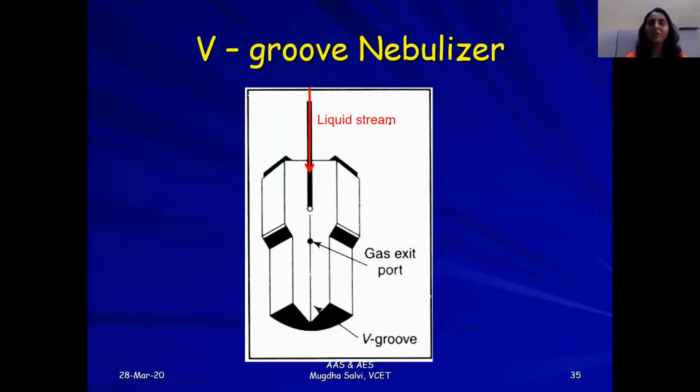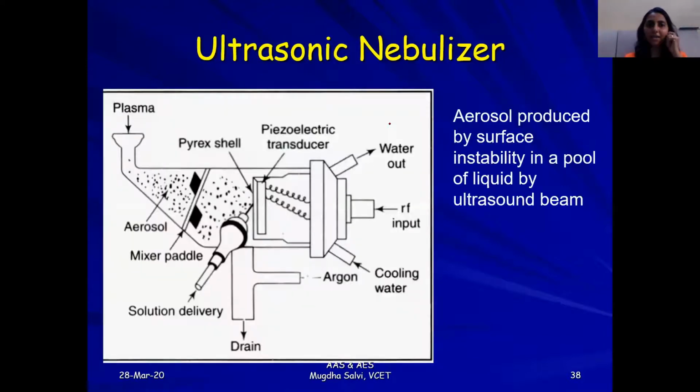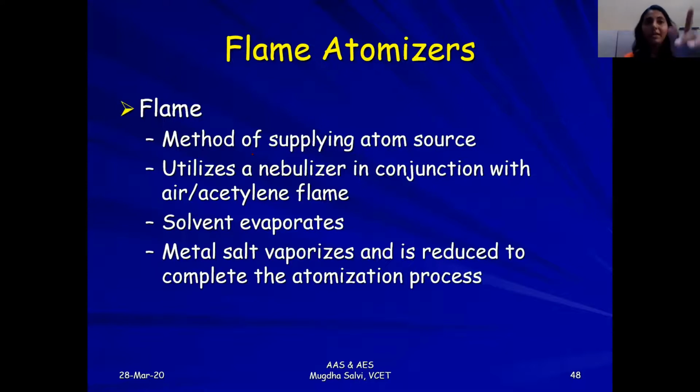Then we have the V-groove nebulizer, and we have the ultrasonic nebulizer, in which you are providing a vibrating surface and the solution is being split into fine particles. So, any doubt in nebulizers till this point?